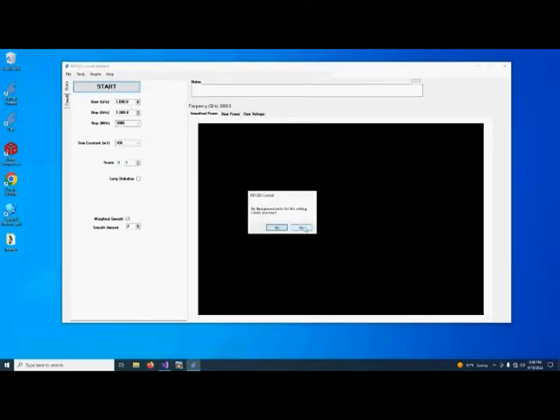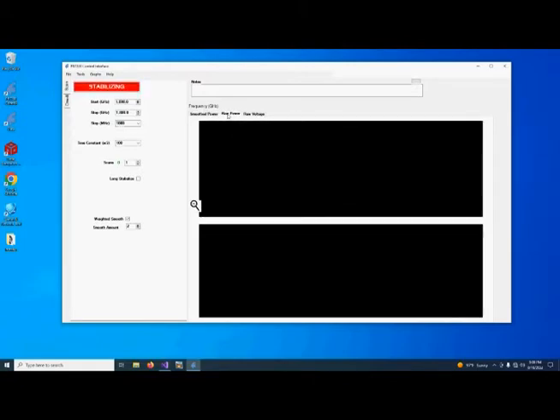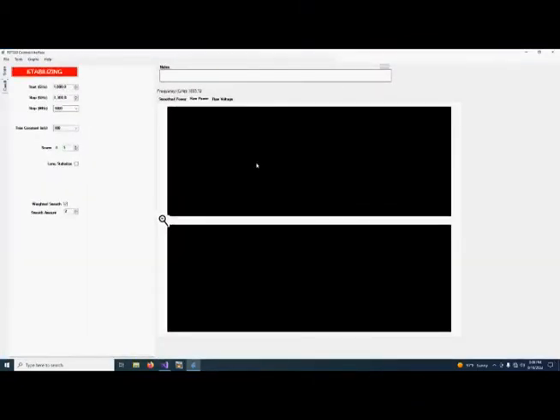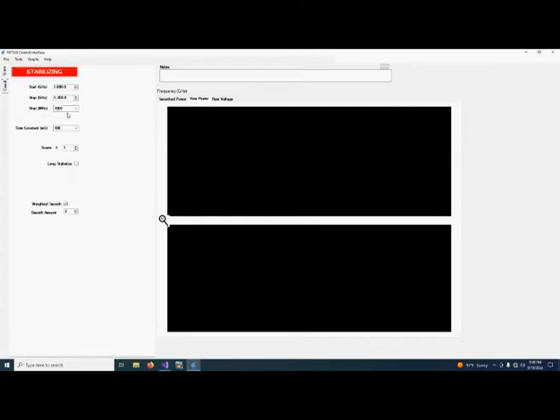We don't need a background so we're going to skip that and we'll start, expand this window. So we're going to take a 1 gigahertz resolution. We'll be doing 100 millisecond time constant which means every point is integrated for 100 milliseconds before taking the next point.